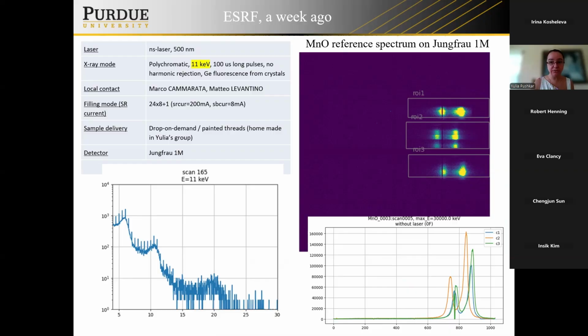But what they can do, which Pilatus cannot do, is produce this energy spectrum as well. Whenever you have a photon, you have to run the detector in a photon-starved regime, but with our PS2 that is not a big issue, so we're always photon-starved. If you have, on this 1 million pixel detector, not more than 1 photon per pixel when you do your acquisition, you can do this processing and sort out some information about the energy of that photon. And as you see, this is excitation at 11 keV, and this is energy in keV approximately.